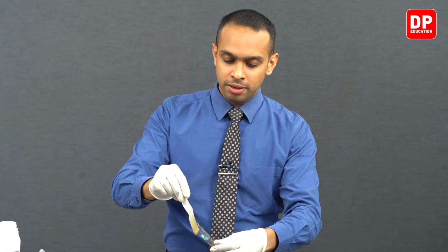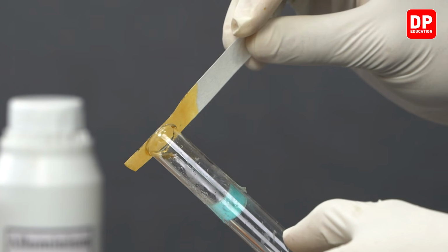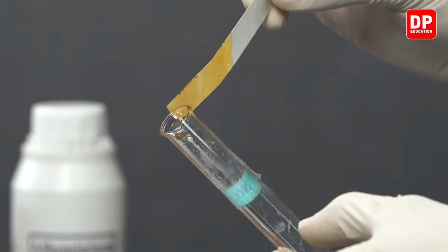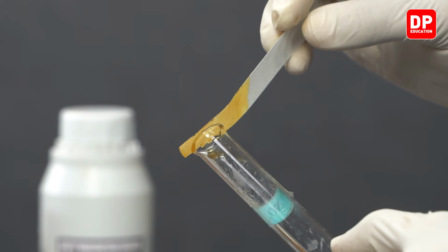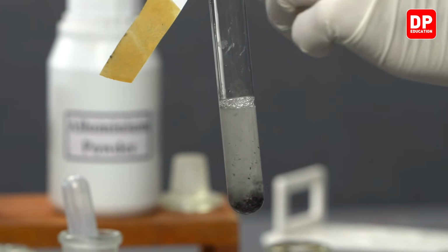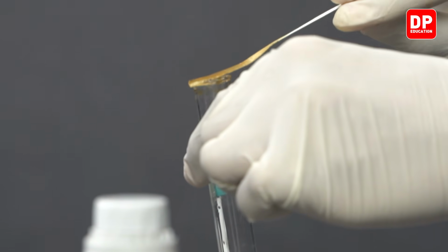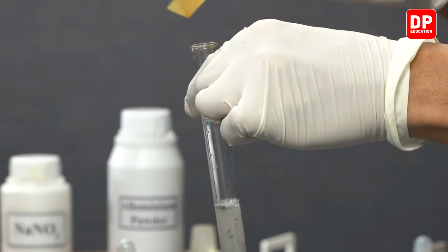The filter paper soaked in Nessler's reagent has now changed its color. We did not start with this color, but now it is very clearly a brown color. This ammonia gas that is produced is exposed to the Nessler's reagent, and therefore it has changed its color to brown.